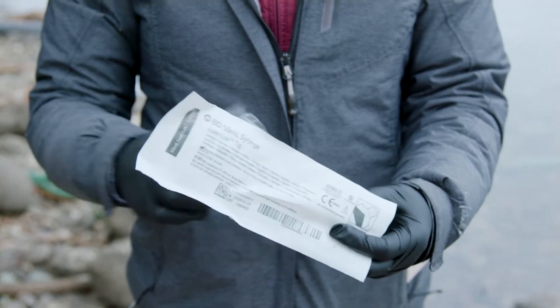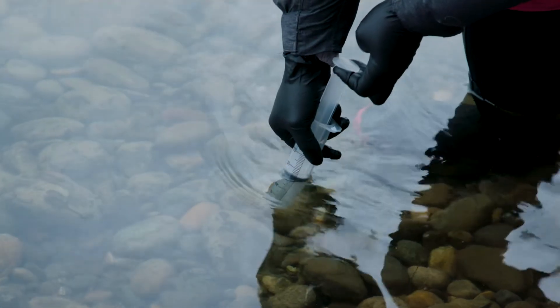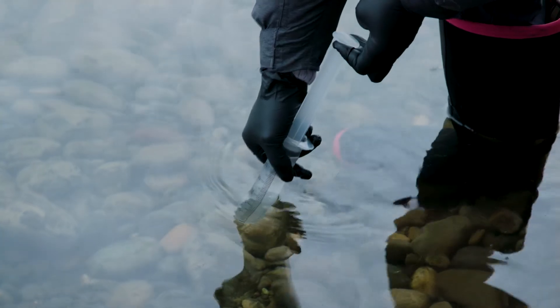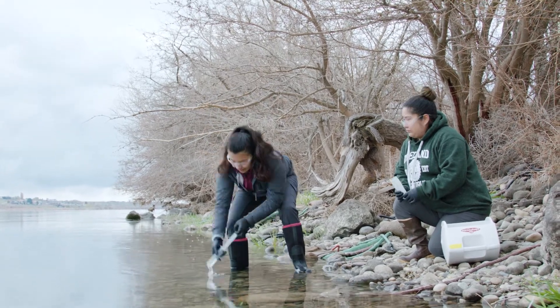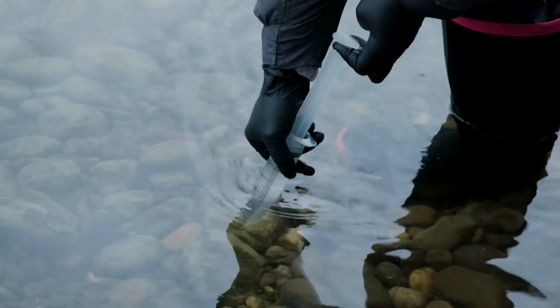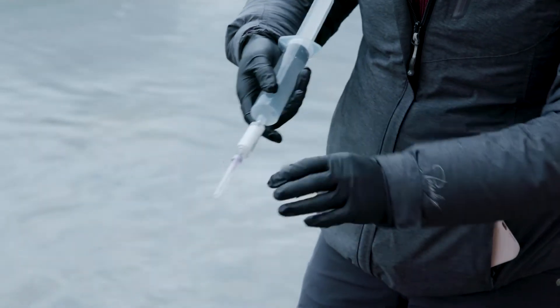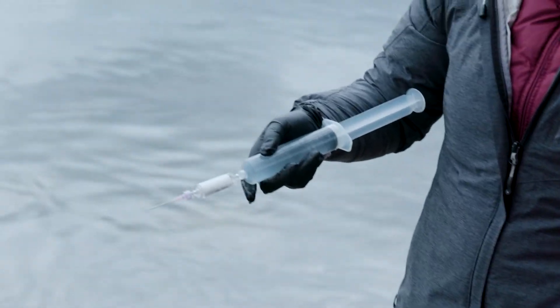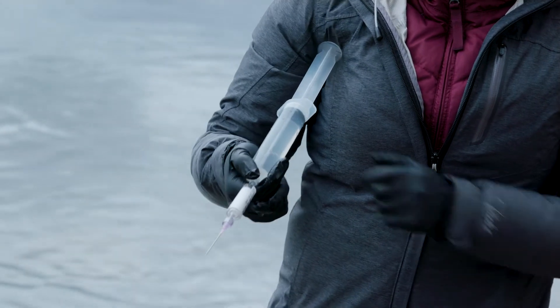Open the 60 milliliter syringe package and remove the syringe. Stand downstream of the sampling location and point the syringe opening upstream. Fill the syringe with river water from 50% of the water column depth. Expel the syringe contents into the river downstream of the sampling location. Repeat this two more times. After flushing the syringe three times, fill the syringe again from 50% of the water column depth — this is the sample water you will be collecting. Screw the syringe onto the filter that has a needle connected to it. Remove the plastic cover protecting the needle. Do not touch the outlet of the syringe, the inlet of the filter, or any part of the needle — this is important to avoid contamination. It is okay to touch the cylindrical filter housing.